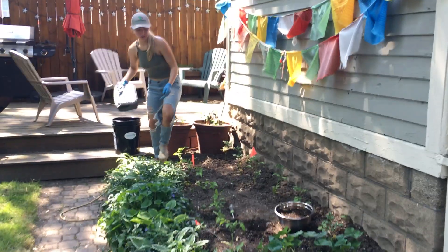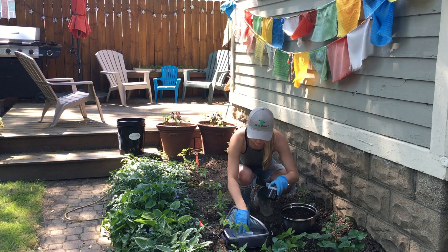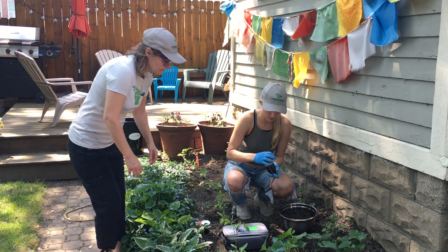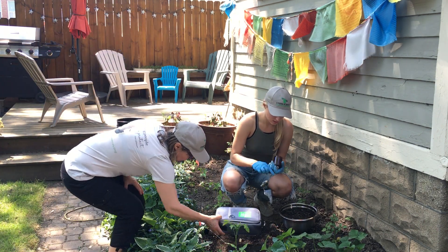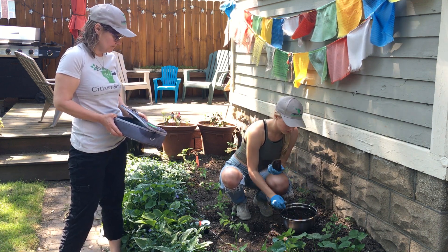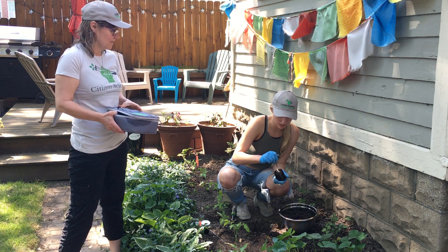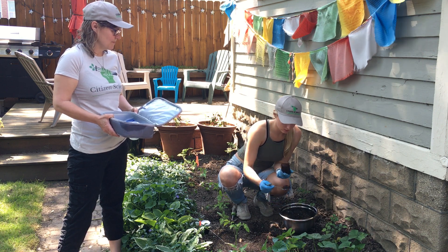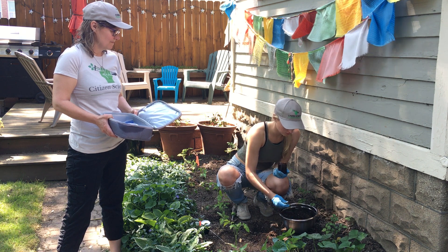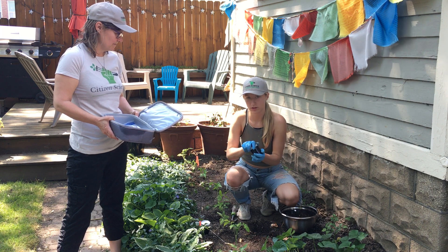After that, you're ready to put the soil into the base container you received. Use the spoon that also comes in the soil kit to take the soil and put it into the container. Make sure you don't touch the edges to avoid messing with the seal, and don't push the soil down, as that can also change the results.